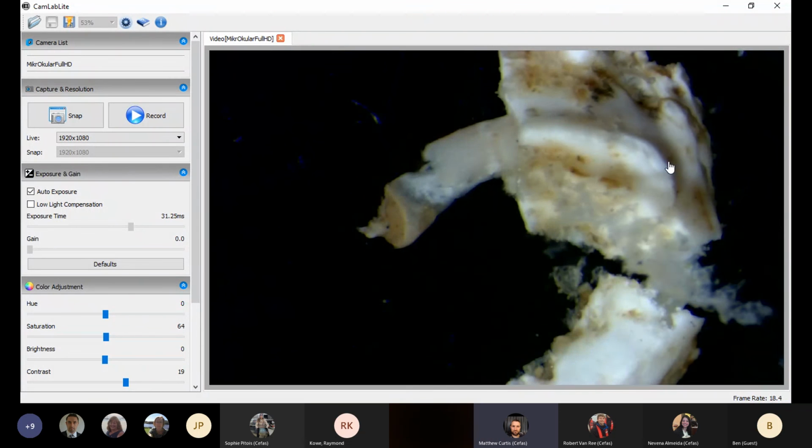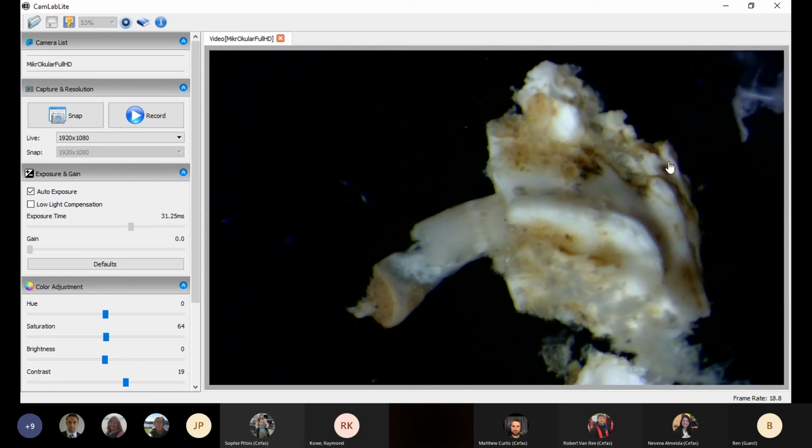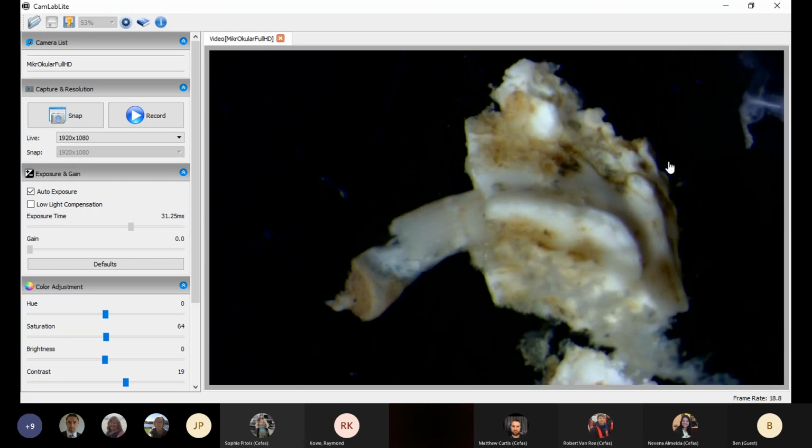that can be seen. So a live view camera down my microscope in the lab. This is a sample we've got from an MCZ, a marine conservation zone, just off the coast of East Anglia, Orford Inshore MCZ. So this is just some fauna that we've picked out, and we'll then start the identification for. This is quite a coarse sample.